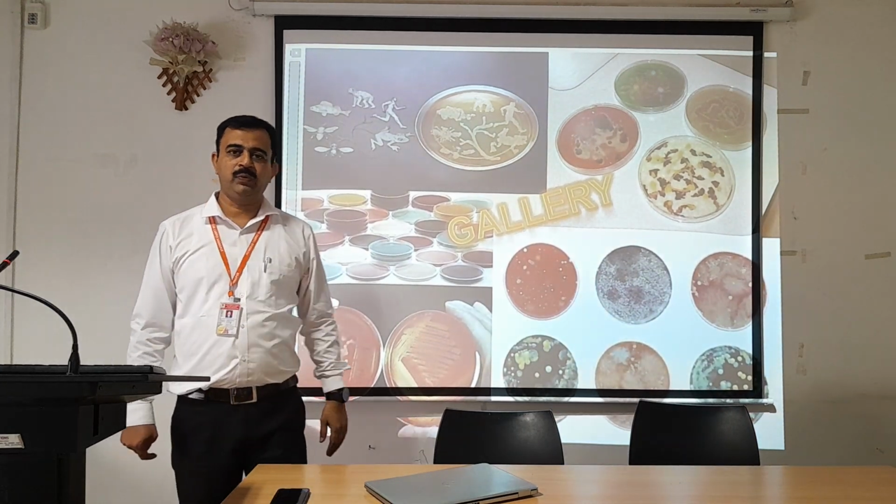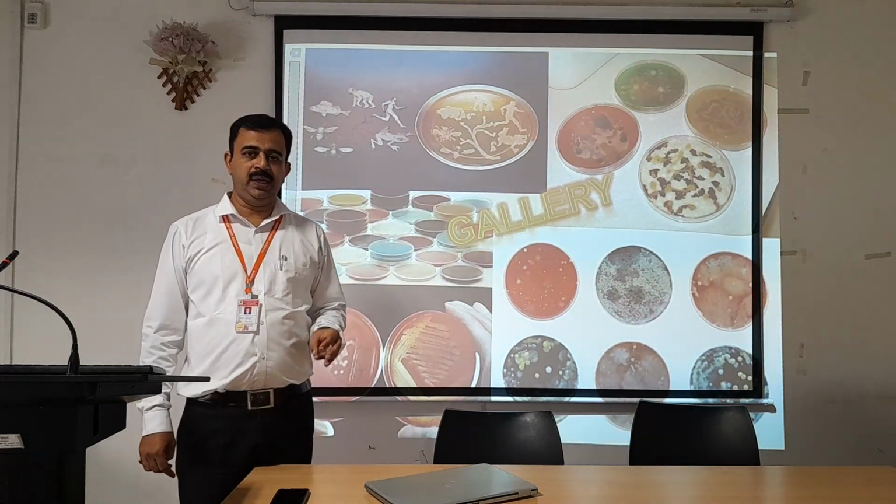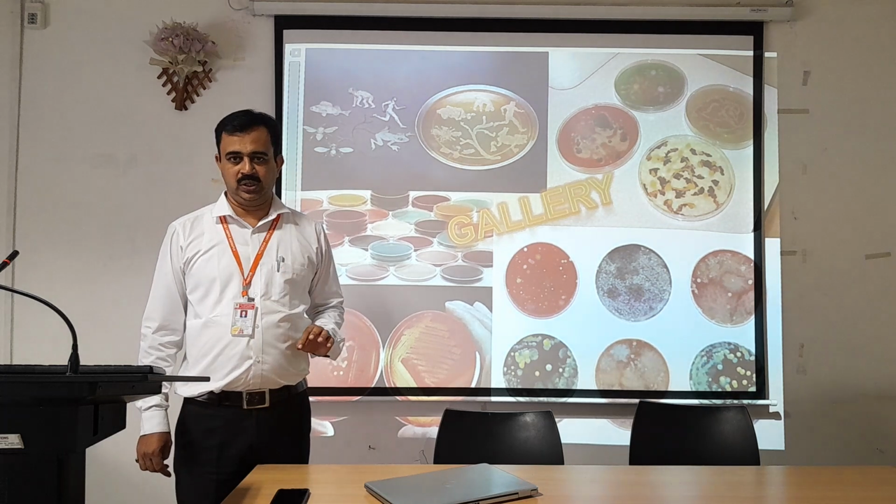Okay? So we'll stop it for today, and what we have learned is three different techniques. One is streak plate, pour plate and spread plate technique for isolation of pure culture. Okay.